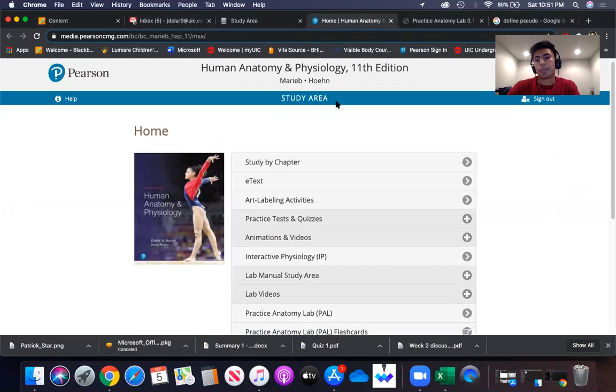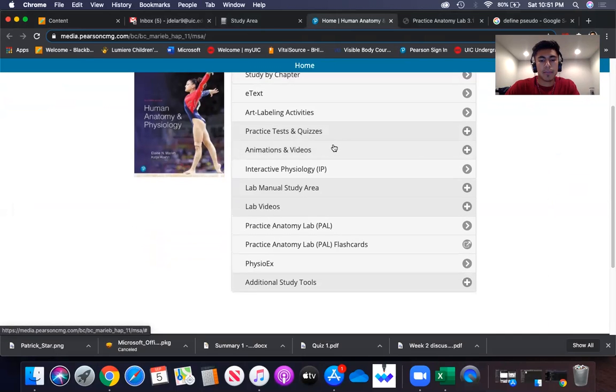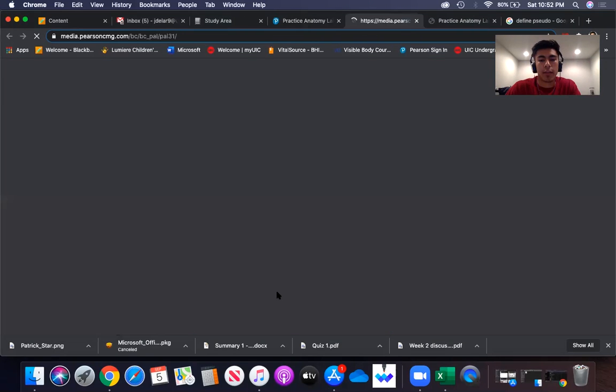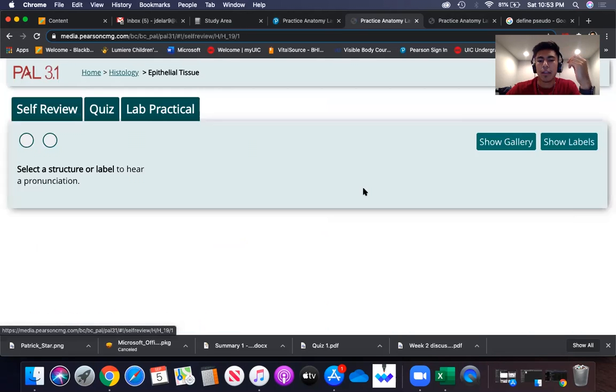For those who don't know, once we get to the study area of your mastering section, Pearson Mastering, if you click on Practice Anatomy Lab, or PAL, you've probably heard this term being thrown around very often. It's a very useful tool for studying. You click on PAL, click on Practice Anatomy Lab 3.1. So once we open up PAL, we're going to go ahead and click on the epithelial tissue section right here. And pretty simple once we start and you look at it.